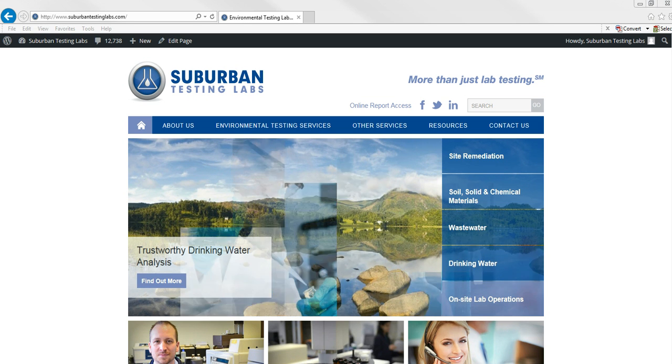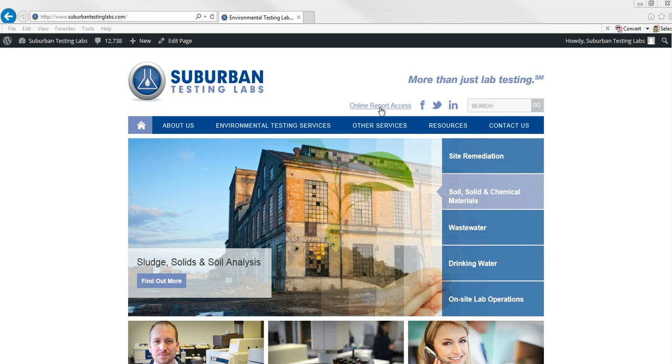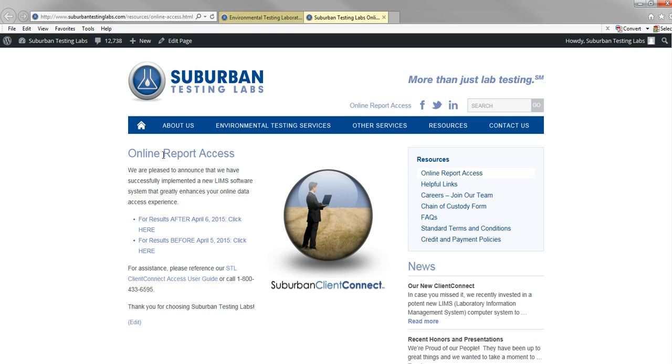When you open up our website, SuburbanTestingLabs.com, you'll see the online report access icon right here on the top of our screen. It's also available under the Resources tab from anywhere on our website. In order to log in, you click on that, and it brings up this web page. Since we recently upgraded our computer system for our online report access, if you're looking for results after April 6th, you're going to click here, and in this situation we are going to be doing that.